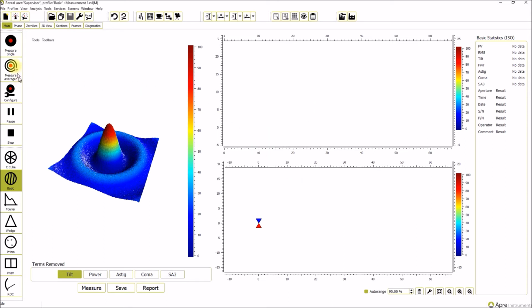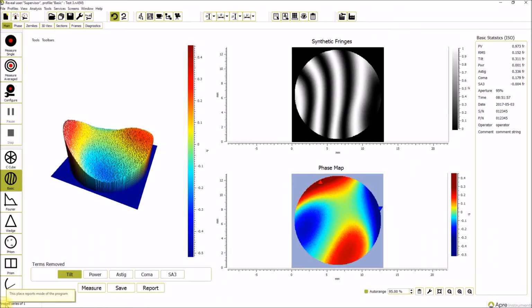So we can take data in this mode by clicking on the auto sequence here, so we'll just start and stop. So it's going to wait. As you see in the lower left, it's idle right now. Now it's measuring 1, and now to wait, and it'll measure again after a delay of 5 seconds. So it's making the next measurement, measuring the 3rd time, and measuring again. And during that sequence, the auto sequence icon here was green, indicating it was running.